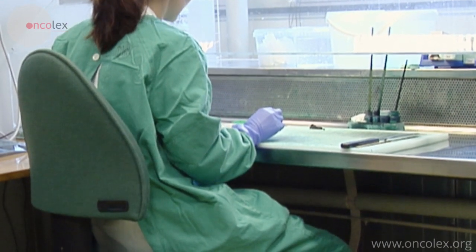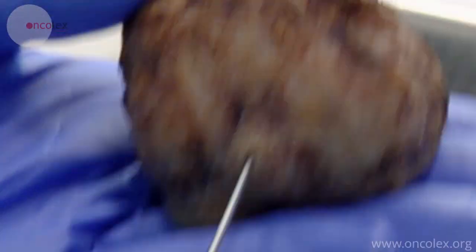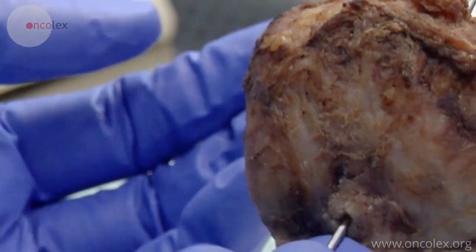The pathologist weighs, measures, and describes the appearance of the prostate. A probe is placed through the urethra to make it easier to orient the prostate.